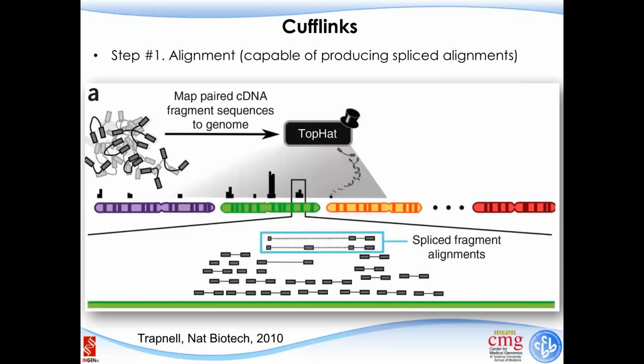So basically, the most important things we want to answer for alternative splicing using input RNA-seq data are, first, what isoforms are in this sample. Second, what is the expression level of the isoforms in this sample. Just think about the alignment algorithm we have introduced, like TopHat, and then quantification of genes. If there is just one isoform per gene, we can directly quantify it by the total expression level, using the total number of reads observed on that gene, like the RPKM.